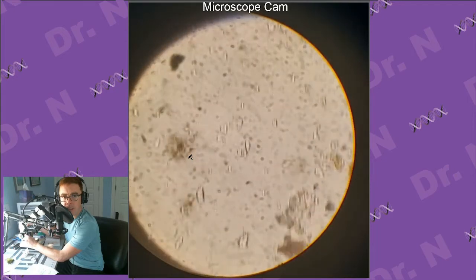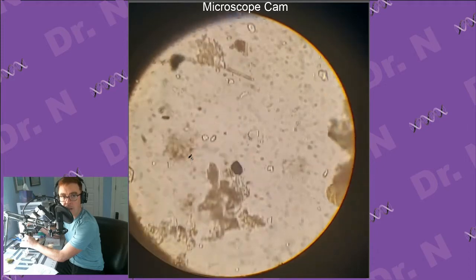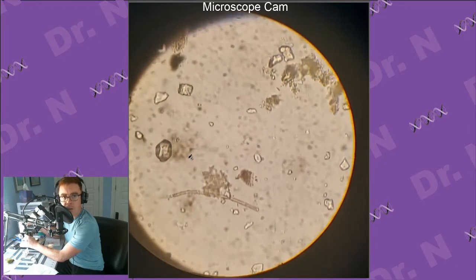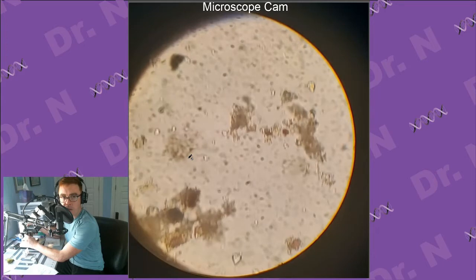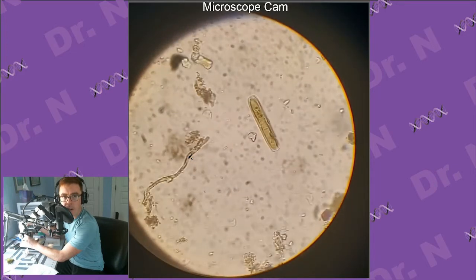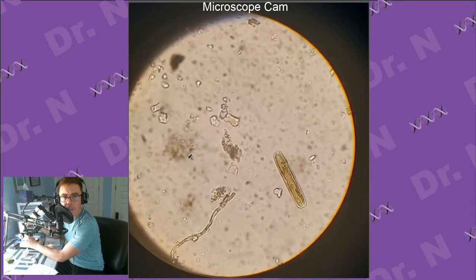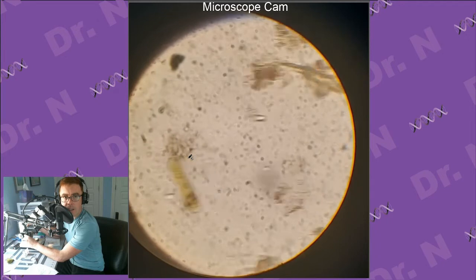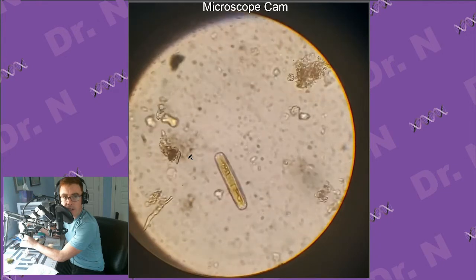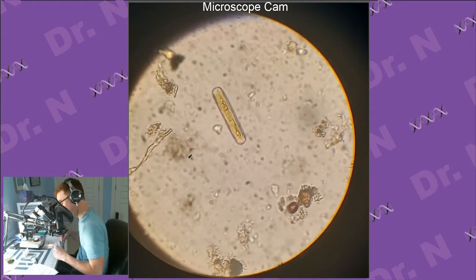Yeah. The point of the stream was to find some DNA, which we kind of saw in those nuclei. But I'll have to try again off stream to see if I can get some actual chromosomes on camera. Okay. I'll leave it on this while I just prepare one last slide with some of my own cheek cells. If I can find my slides, there they are.